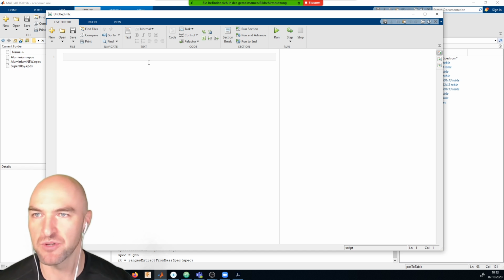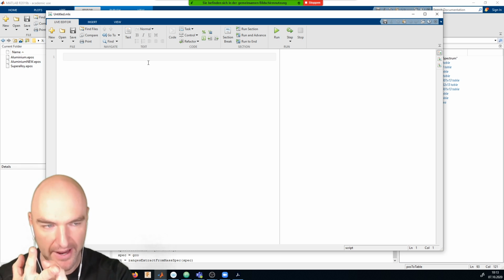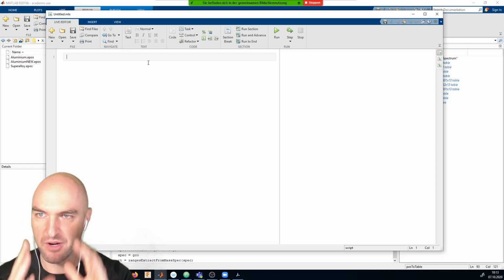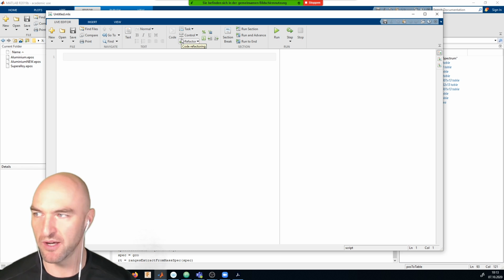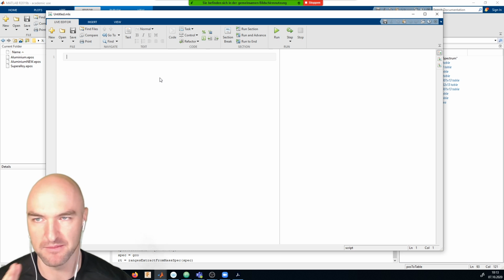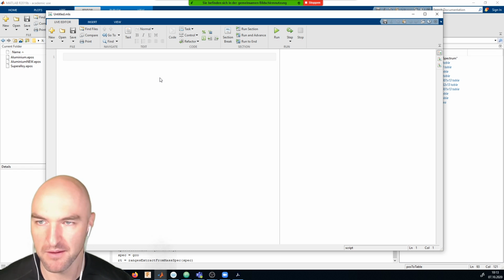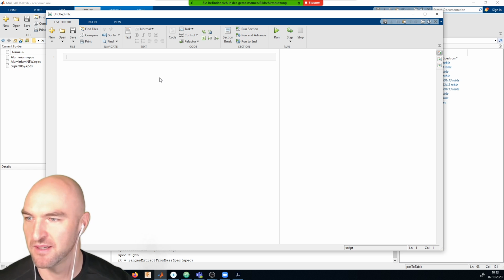What a live script really is, is a combination of graphics, text, and code. So you can combine graphics, text, and code in one file. And I will just show you that without any real Atom Probe data, because I will just show you with some.